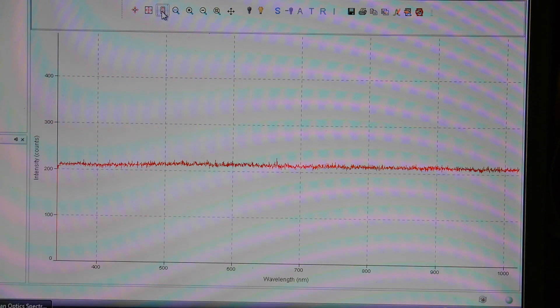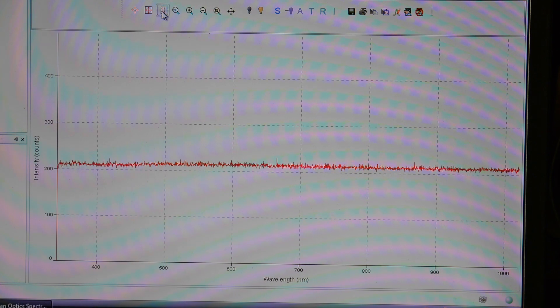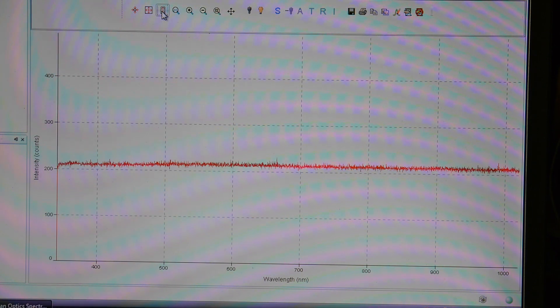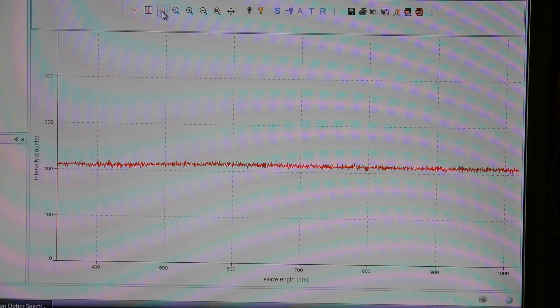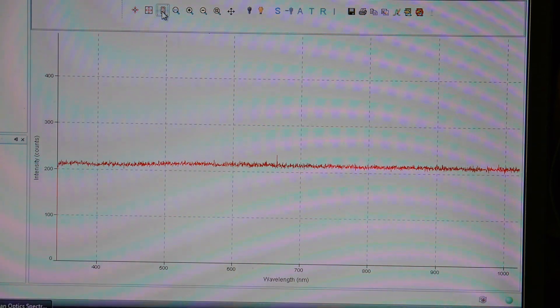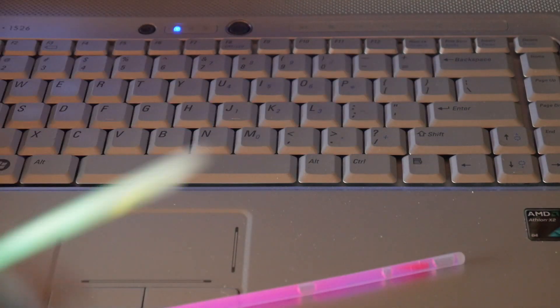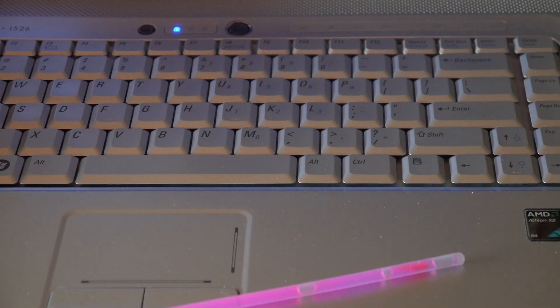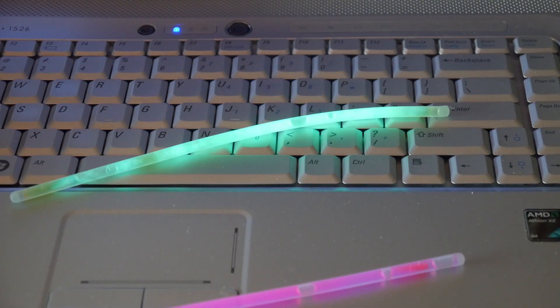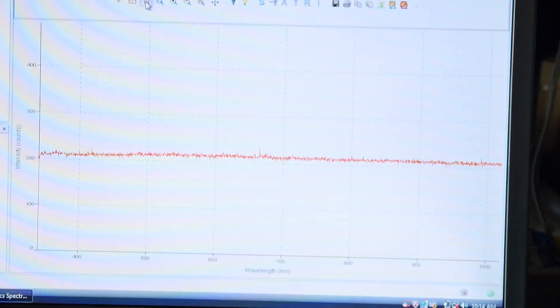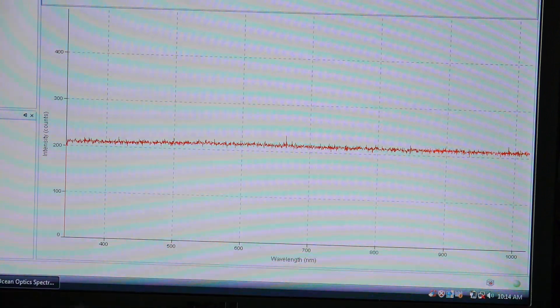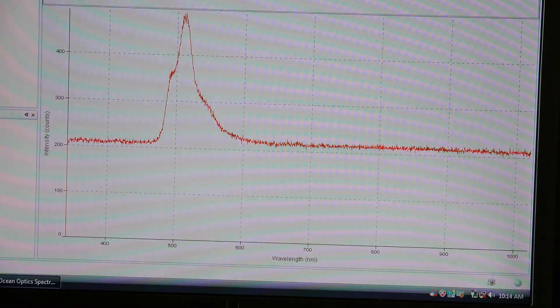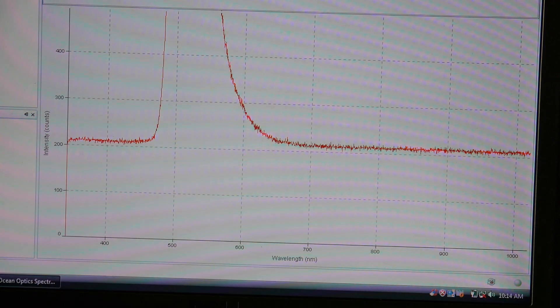Let's see. We've seen... Oh, this one looks different. Okay. This one looks like a green one. Oh, it's definitely, definitely green. It's not the yellow one that we saw. This is a green color. Oh let's see what it looks like. Green. Very bright green. Very nice. Very nice bright green. Oh there we go. Oh wow.